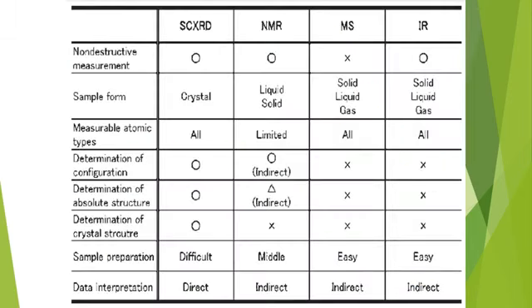Here is a chart that has some comparison between the different techniques, single crystal XRD, NMR, MS, and IR, and how we can determine the properties of a crystal by using these techniques. These are all discussed here relatively: which one of them is a non-destructive measurement technique, for which technique we have to prepare the sample, and whether the sample should be solid, liquid, or gas.